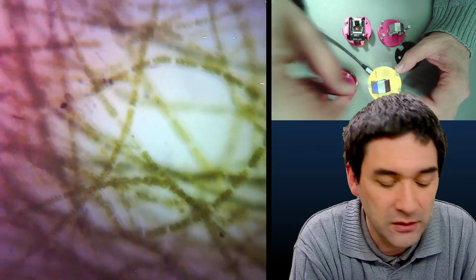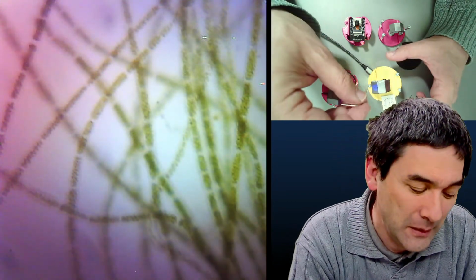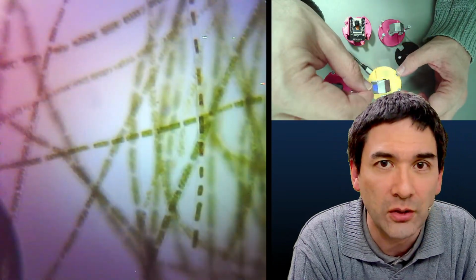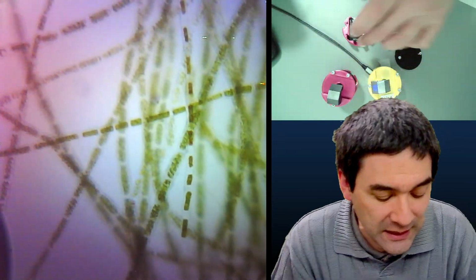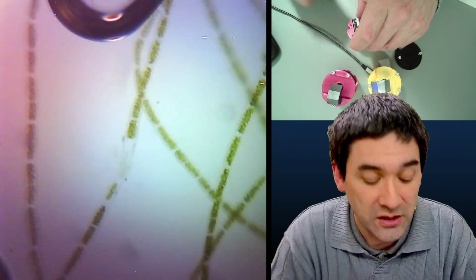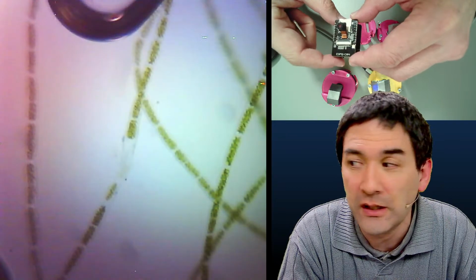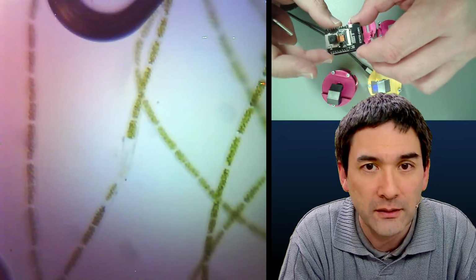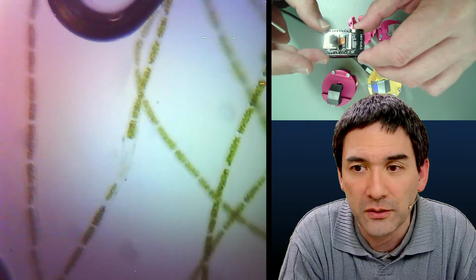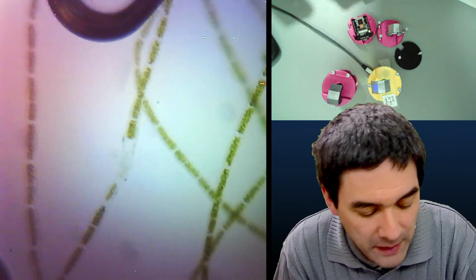Basically you can use this microscope to directly live stream things like I'm doing right now. But it's actually a camera module that's also used for home surveillance, and it's a standard camera module. And how much does it cost? It costs around €6 or $6. It's really cheap, and it actually contains a Wi-Fi module and everything, and it's quite nice to be used here. So I'm going to show this microscope a little bit to you, how it's actually set up.